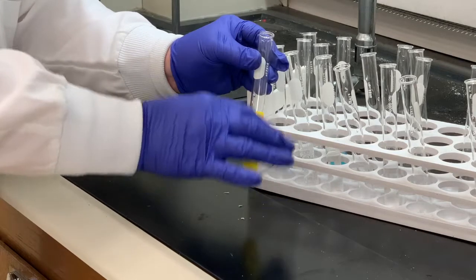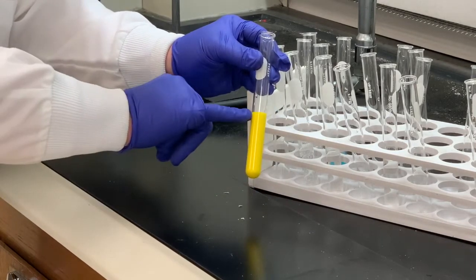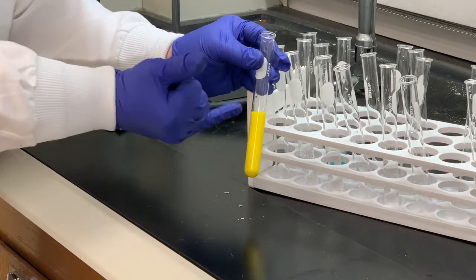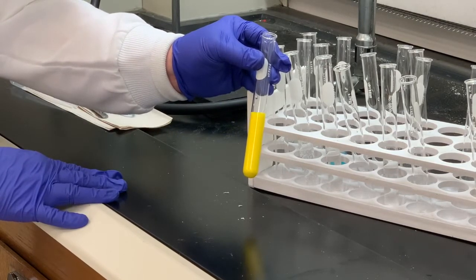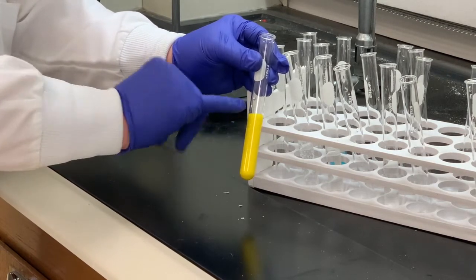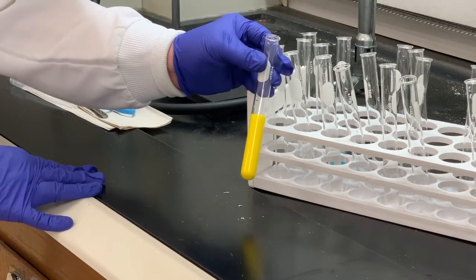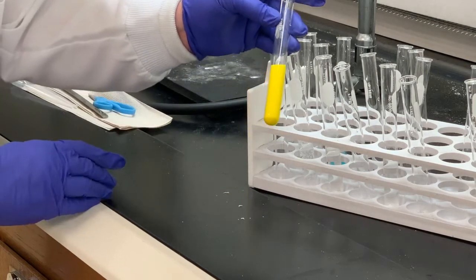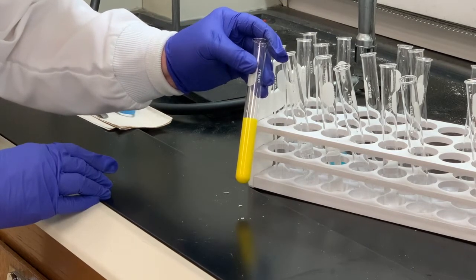When we let this sit, and we'll come back to this and take a look at it toward the end of the experiment, but just by gravity, all that solid will eventually go down to the bottom of the test tube, and what we should see above that is what they refer to as the supernatant liquid. That term is in your lab book, and that supernatant liquid is that liquid that always rises above that precipitate. Did a reaction occur? We would say yes. Again, no heat change, no bubbles, but we did see formation of a precipitate, and again, yellow.